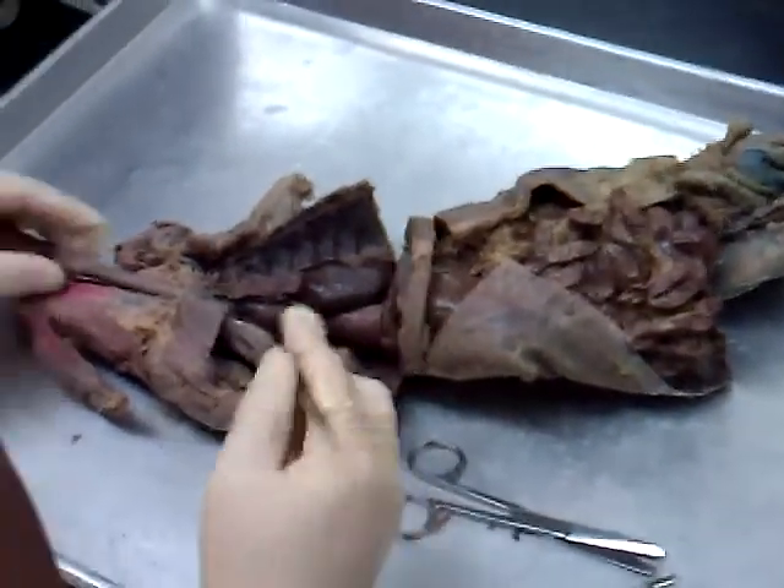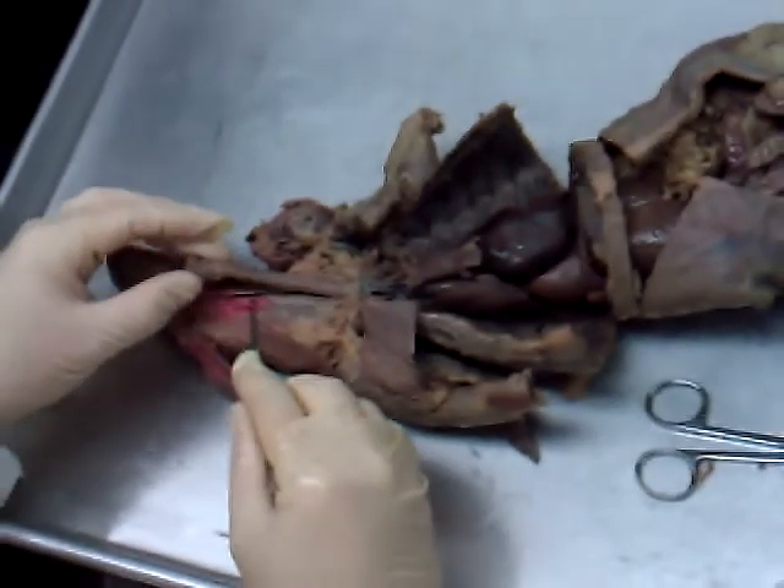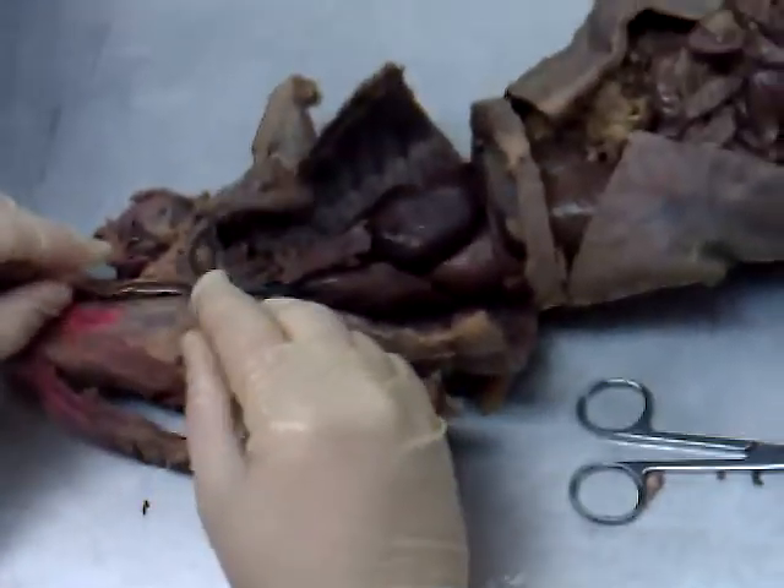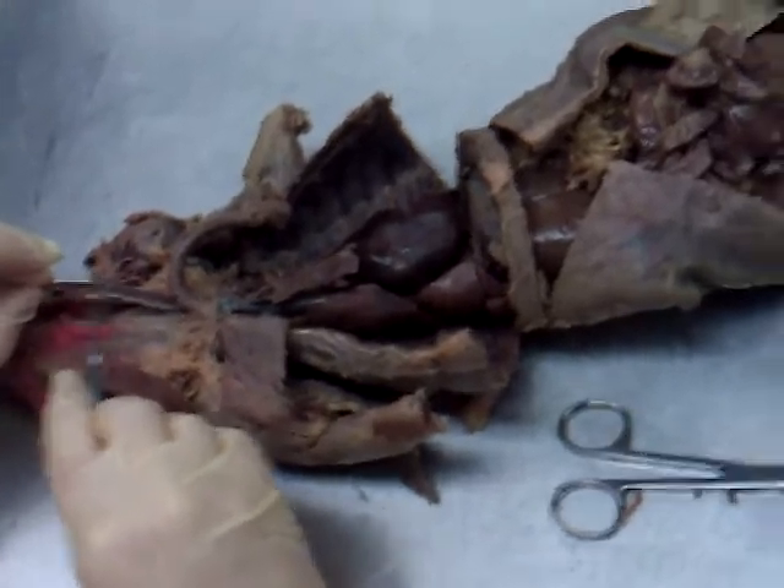What can we identify on this mink? Number one, right here we have the mink's larynx, trachea. Pull that back out of the way — behind it, this brown tube is the esophagus.